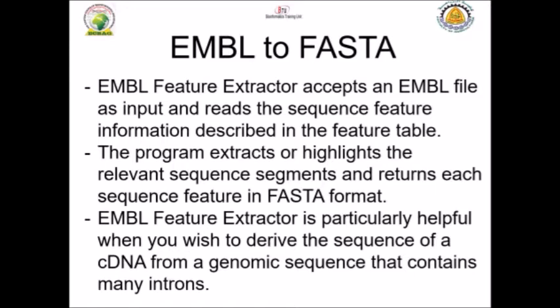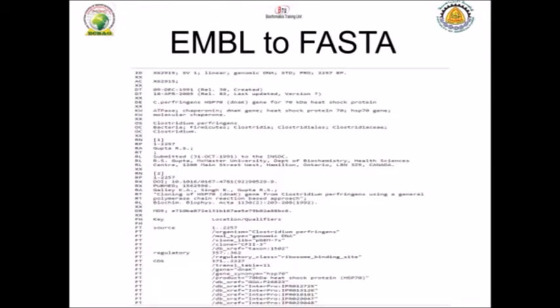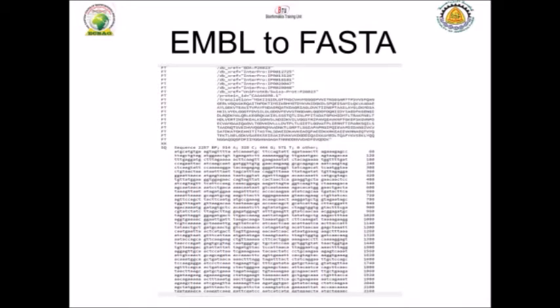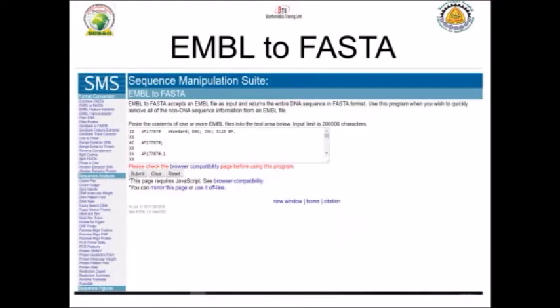This tool is called EMBL to FASTA and it will help you extract your genomic sequence from the EMBL sequence file. As we can see, an EMBL file usually contains a lot of information that may be difficult for beginners to work with. That's why you need this program — EMBL to FASTA — to get directly to your genomic sequence without any other data that may not be needed right now.